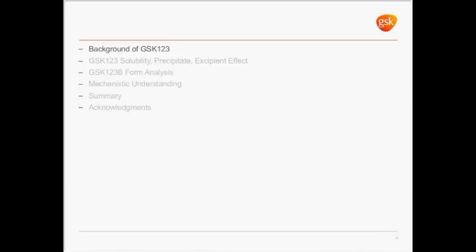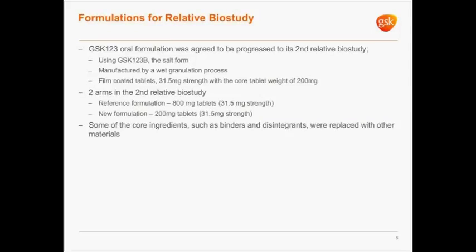So let's begin by talking about the specific drug that we investigated, which is the primary focus of this case study. As you can imagine, I can't reveal any proprietary information about this particular drug, but I've given it a nomenclature of GSK 123. It's completely made up, but the data that you're going to see is taken directly from the experiments that we ran using the Freeslate robots and the support equipment that goes in with our automation lab.